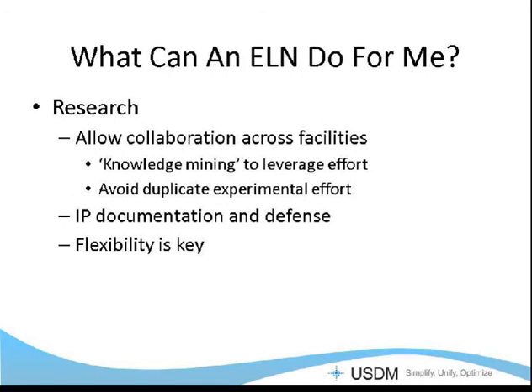You have a time-stamped audit trail of when things happen, and it's useful for proving point-in-time activities. The key with research ELNs is that they have to be flexible. Research scientists will design experiments. They don't know how the experiment's going to go when they go into it. You can't have a rigid structure.